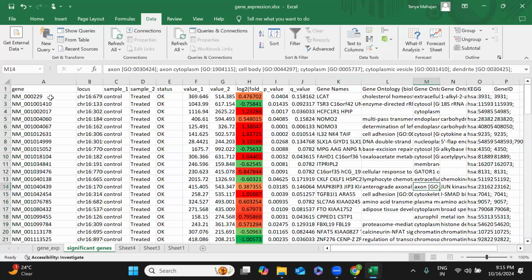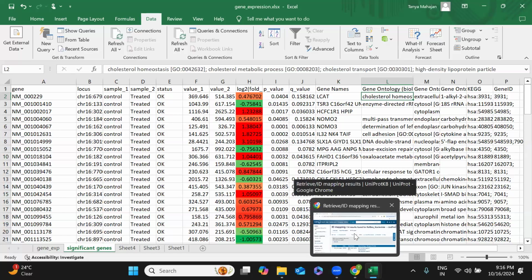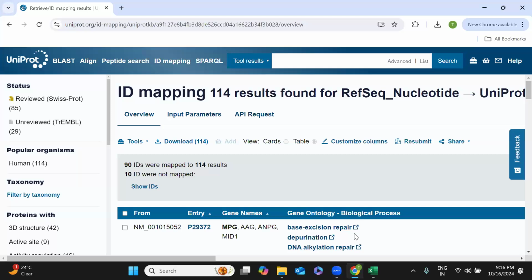Did you get the complete information now? For this, if I ask you what is the gene for this particular NM IDs, you can say LCAT is the gene. Correct. Yes, ma'am. And if somebody asks what is the function of that, you can see this is the function. And it's not that every time in the research you are dealing with only the function part.